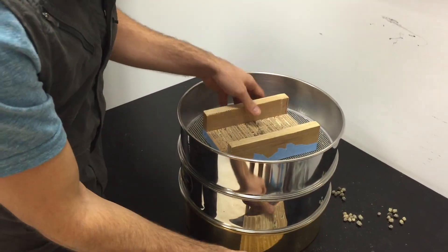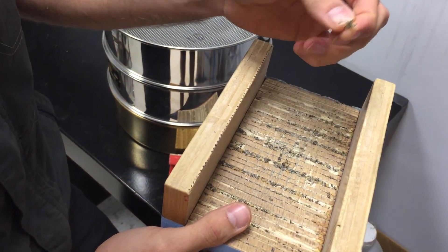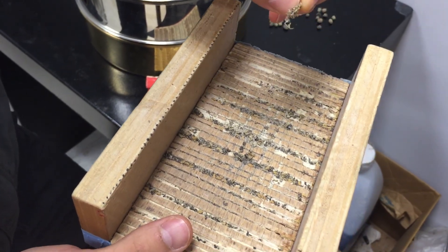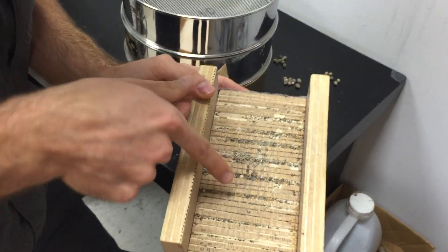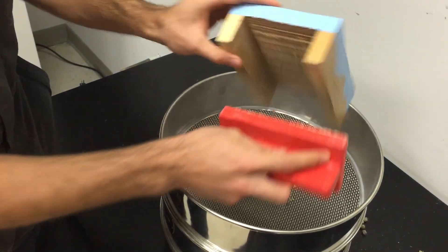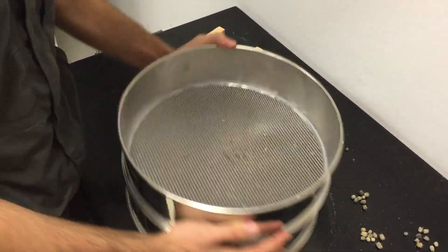Now it seems like I got it. The way we know we have it is you'll end up with the pod remainders that look not very structurally there — they're ground up and you can actually see the seeds that are falling off. So give it a quick whack to get that stuff onto the seed layer here and filter it all through.